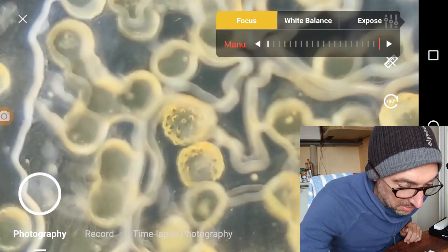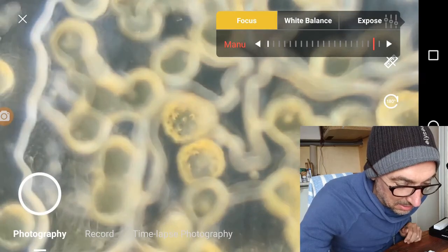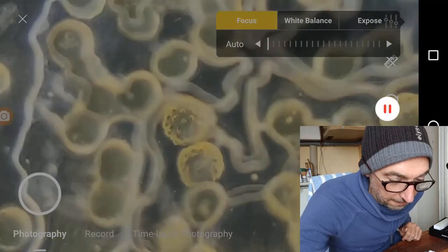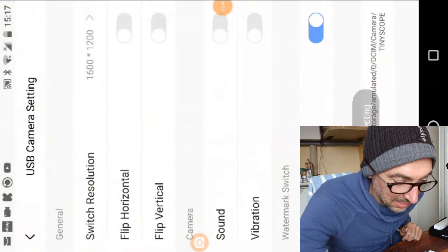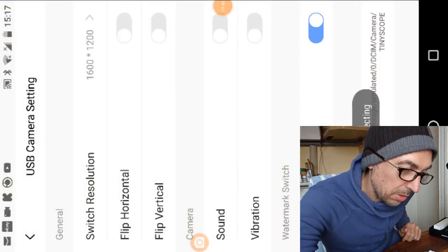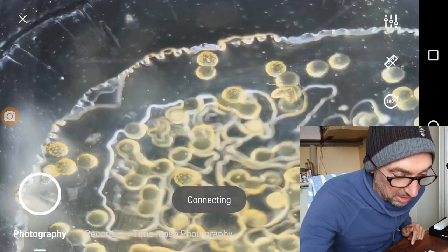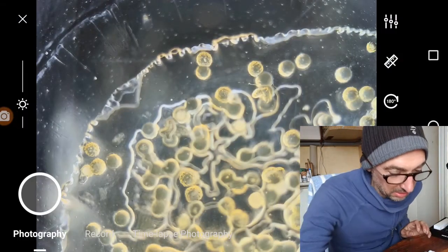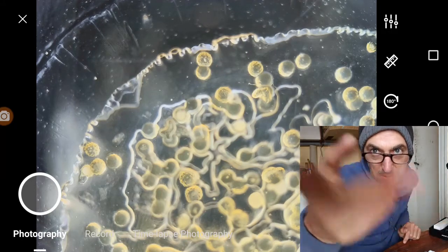We have manual focus, and sometimes you get better results, but mostly it's best as close as possible, so back to auto. Here - oh no, do not stop recording - there's 1600 to 2000 resolution. If you choose higher resolution it gets very slow. This is on a Nexus 6.